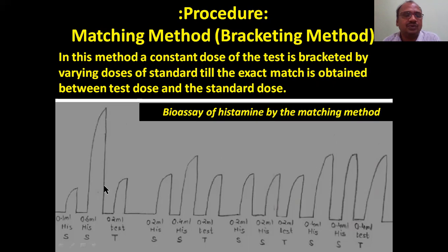First, what you have to do, all 3, 3, 3, 3, you keep in your mind. Each 3 means 2 standards and 1 test. That point you have to keep in your mind. 2 standards, 1 test; 2 standards, 1 test. Like that you have to do.